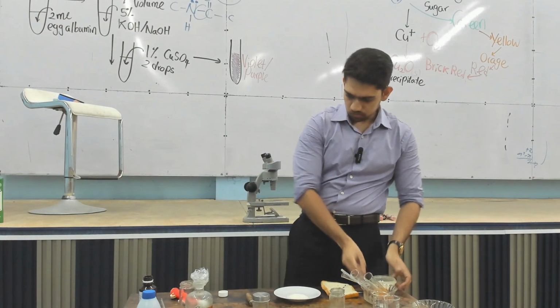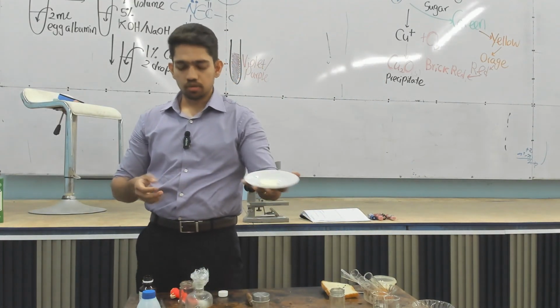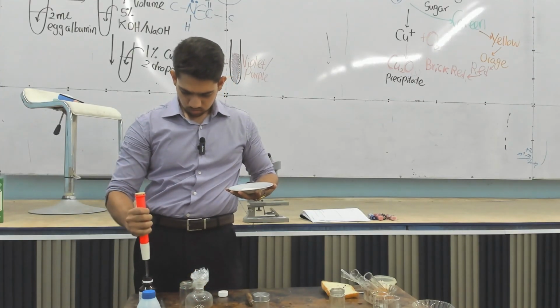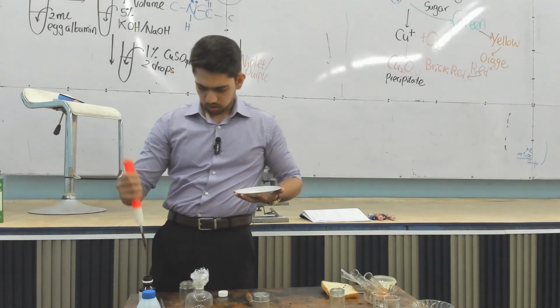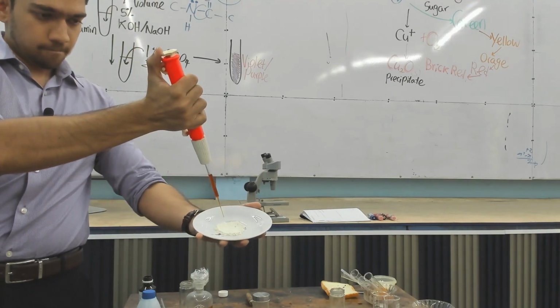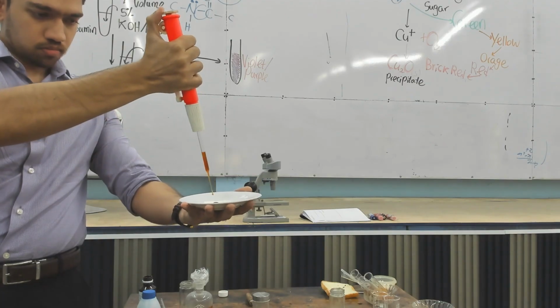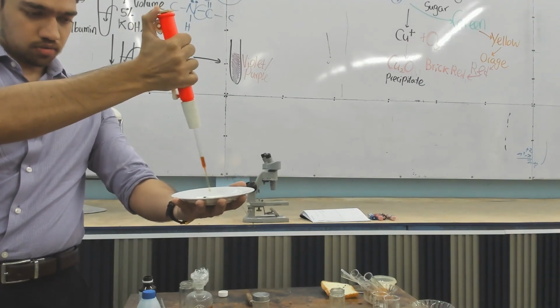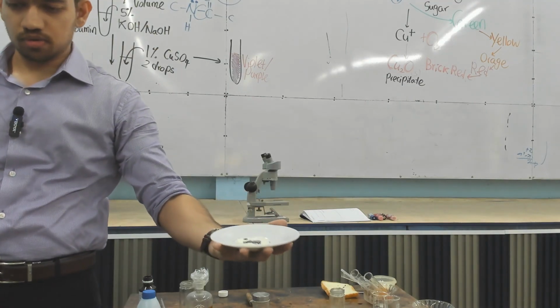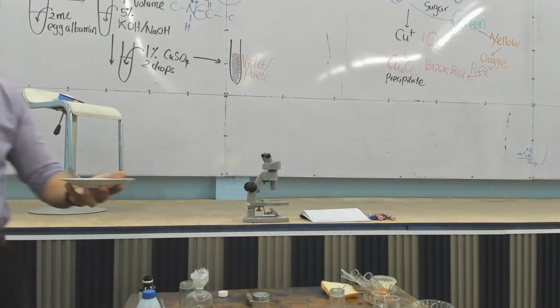Okay, to that also, so this is the color, no? White. To that also you can add some iodine, because it's not mixing very nicely, right? Can you see? It is reacting with the top part of it, right? Or we can do something different.